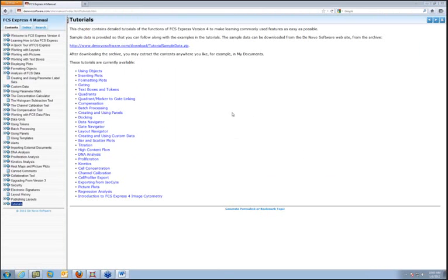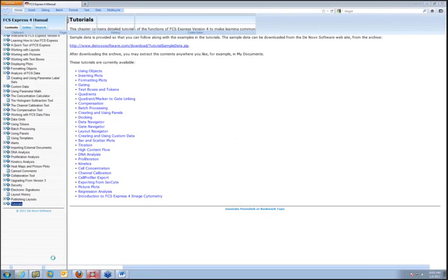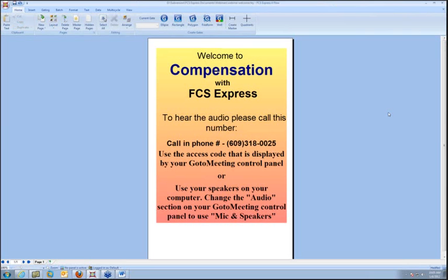One of the things that didn't change about FCS Express is that the compensation settings are still by default loaded automatically from your data file. This is something that didn't change, but I want to point it out because it is something that some people don't know that they have the capability to control.